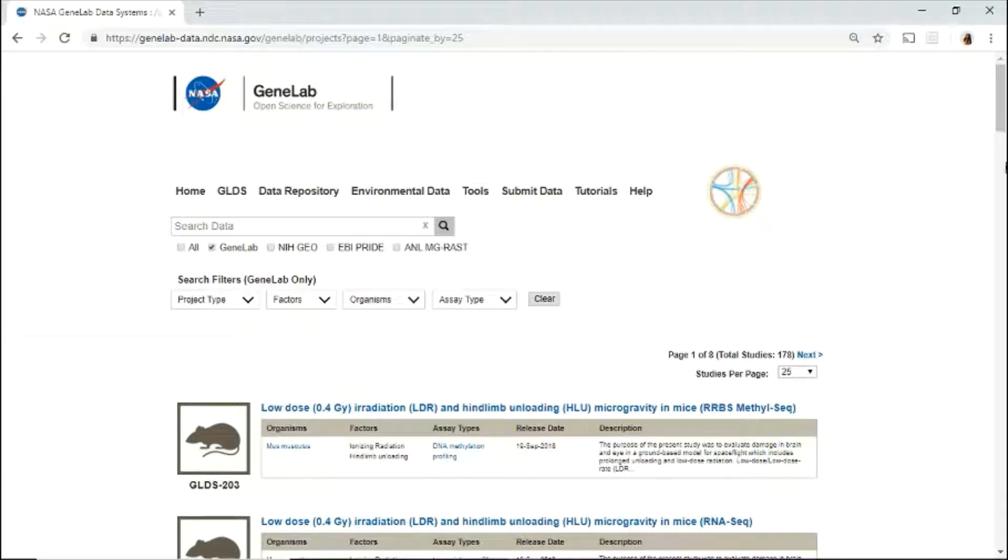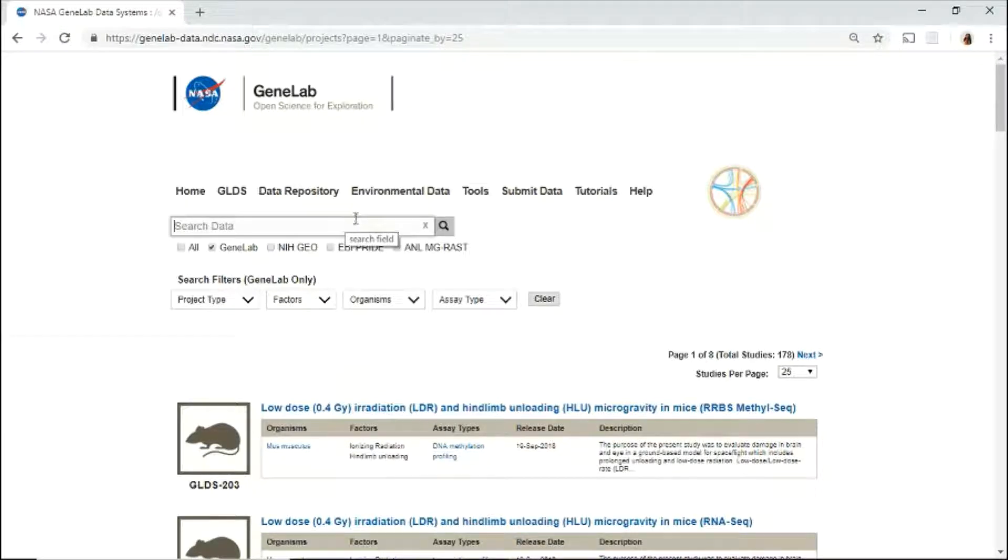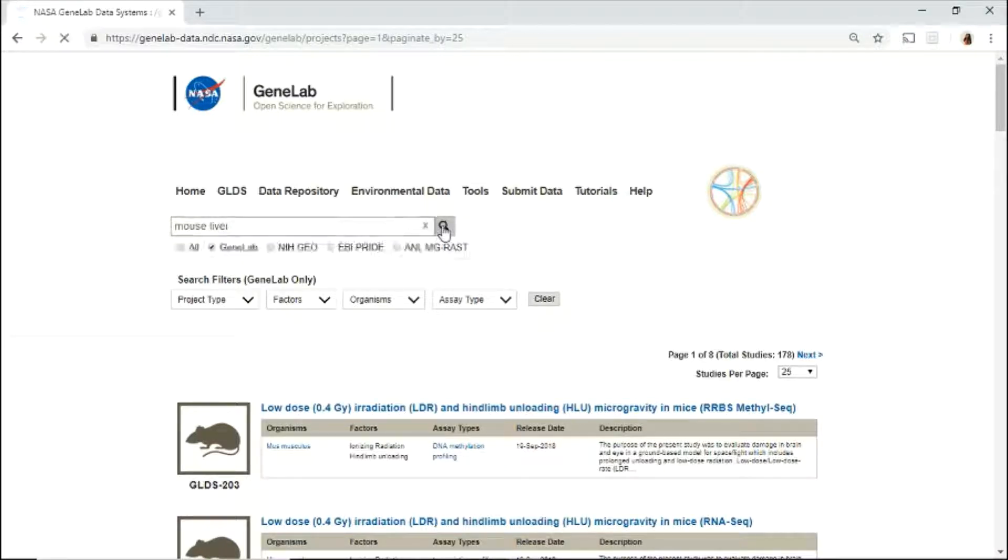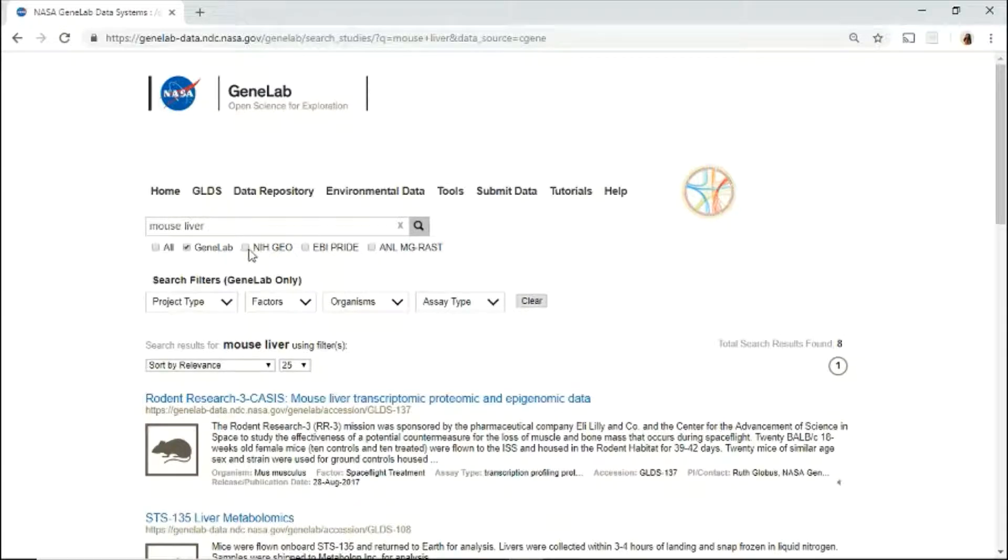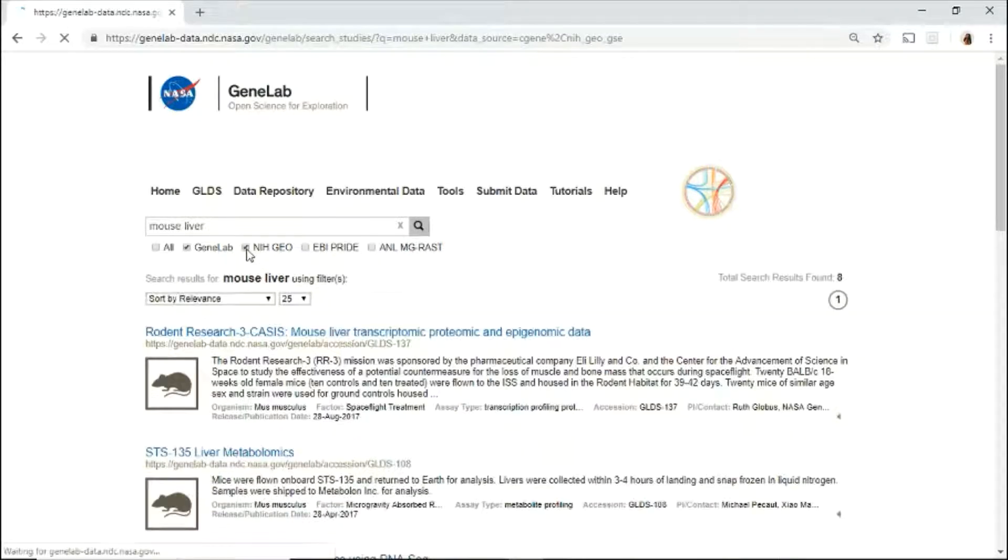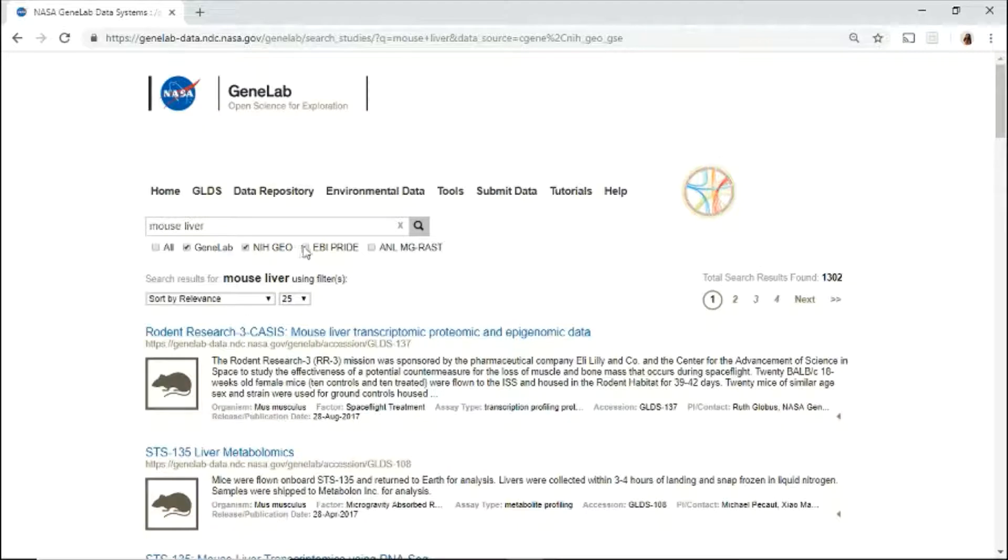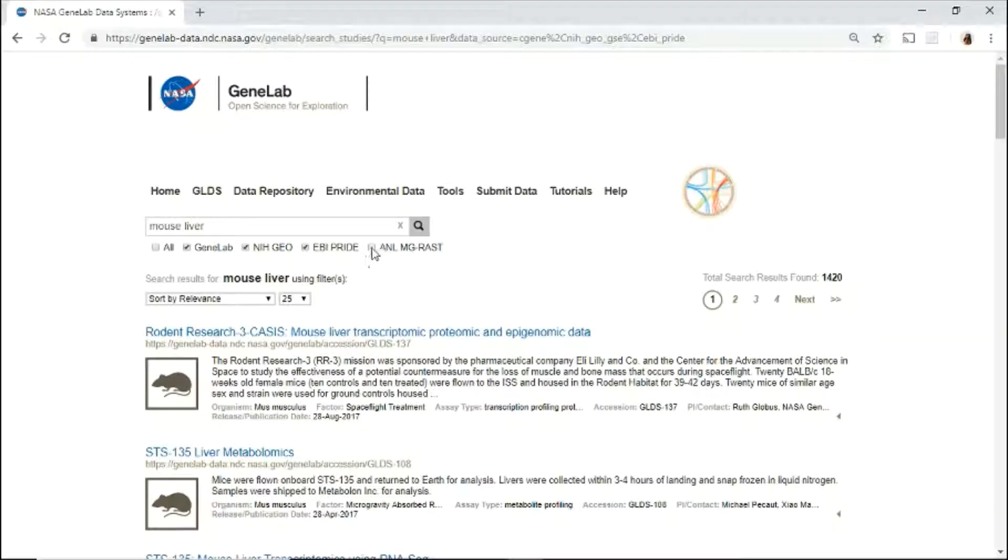You may search the repository by using the search bar or GeneLab search filters. In the search bar, enter keywords. For example, mouse, liver, and click the magnifying glass or enter to search. You may also search across various databases such as NIH-Geo, EBI-Pride, and ANL-MG-RAST.